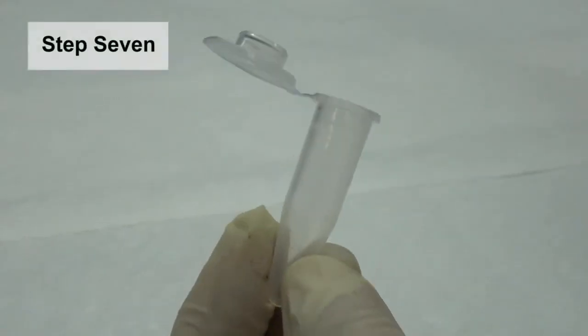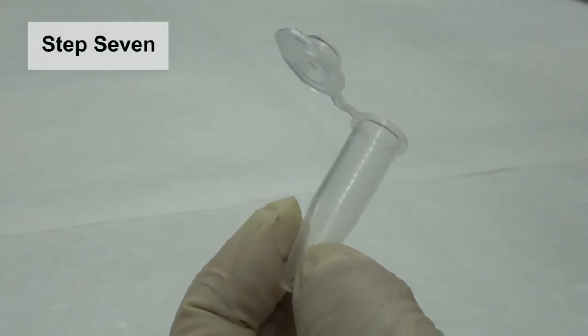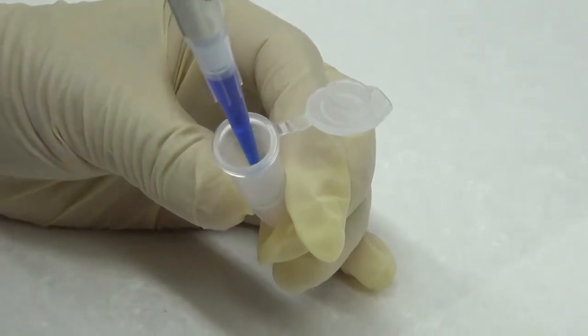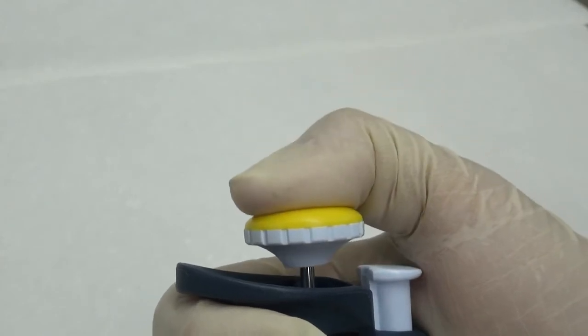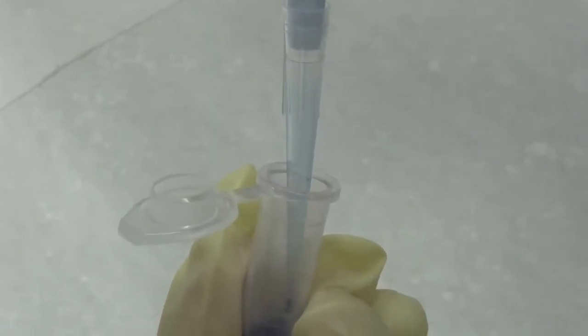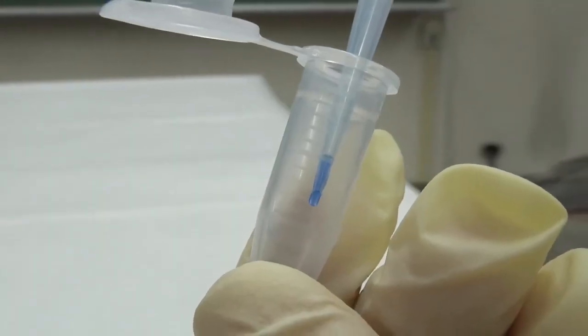Step 7. Slightly tilt the receiving vessel and touch the tip against its inner wall. Gently press the operating button to the first stop and dispense the solution. Some liquid remains in the tip because of adhesion.